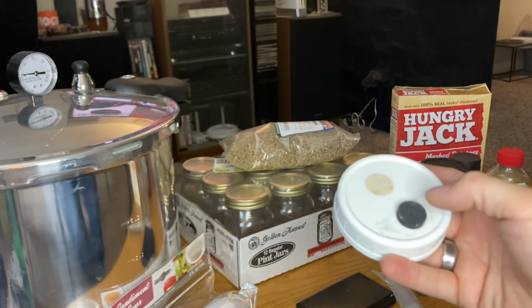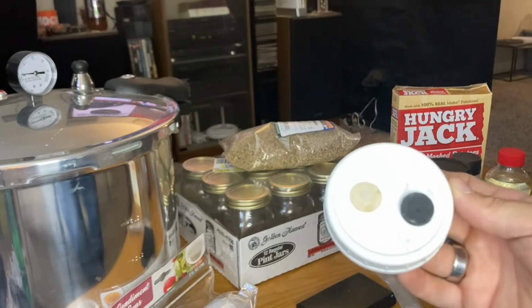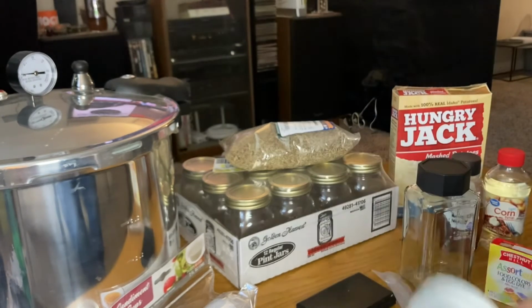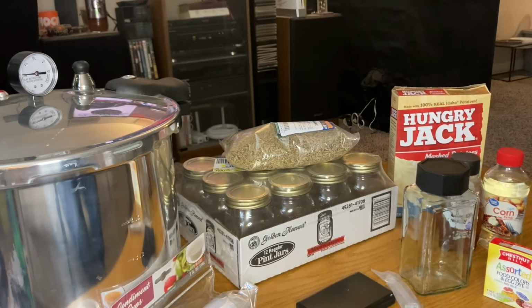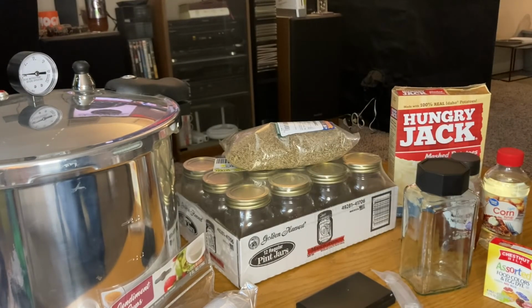There's ones that you can stick on like this one is, or there's ones that you can fit through the hole as well. And that is how you get your rye berry jar, so that you have your air exchange, and so you have your self-healing injection ports.